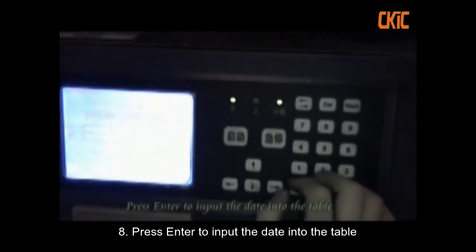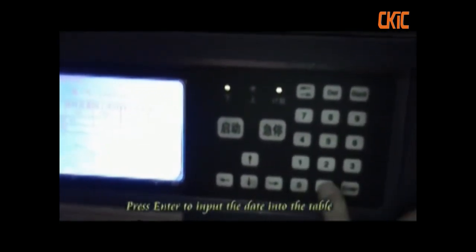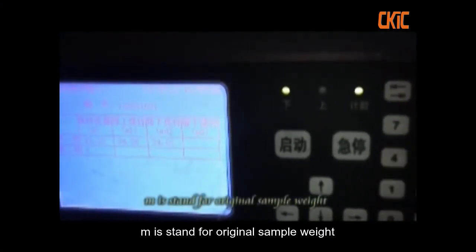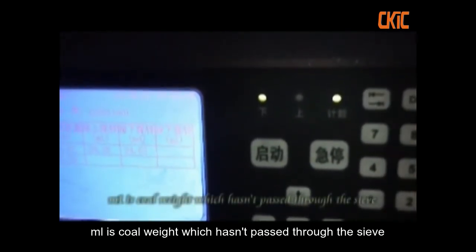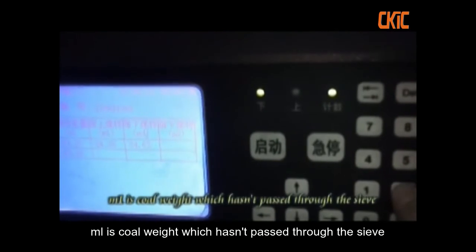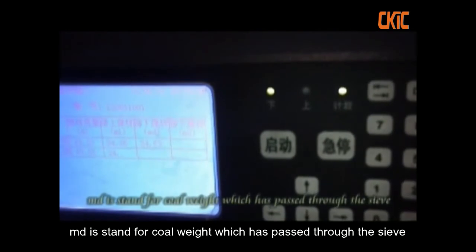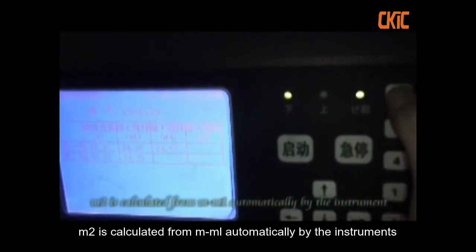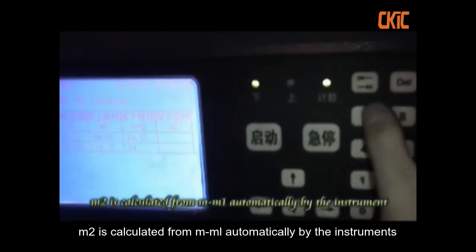Press Enter to input the date into the table. M is stand for original sample weight. M1 is the coal weight which has passed through the sieve. M2 is calculated from M minus M1 automatically by the instrument.